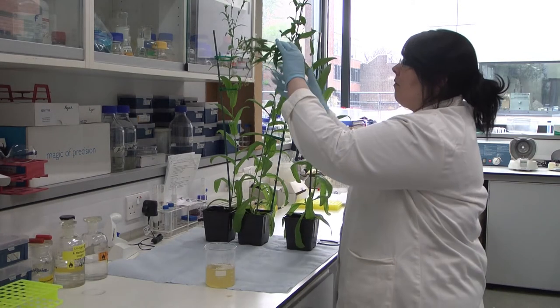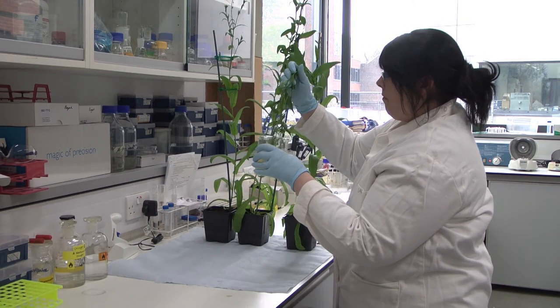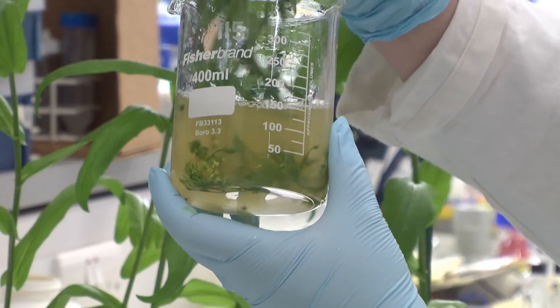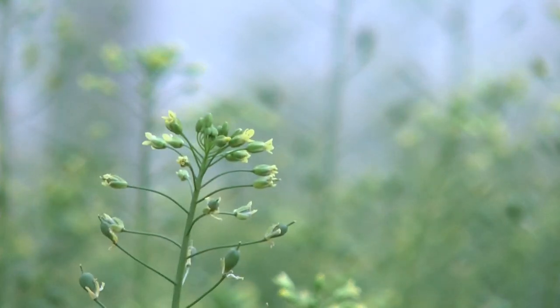To introduce the algal genes into camelina we just have to dip the flowers of a plant into the bacterial solution. The bacteria we're using here is Agrobacterium, which naturally transfers genes from itself into plants.